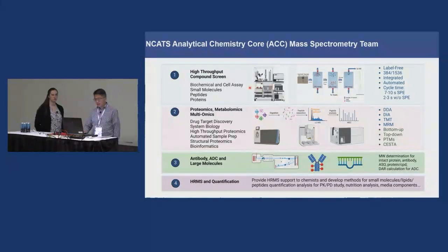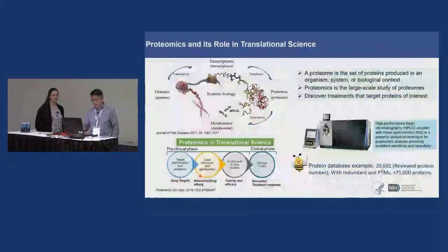The next major area our lab focuses on is multi-omics, especially proteomics. We do drug target discovery, systems biology, structural proteomics, and also bioinformatics. Today we will highlight high throughput proteomics and automated sample preparation. We also run antibody work and some high-res support for our medicinal chemistry team.